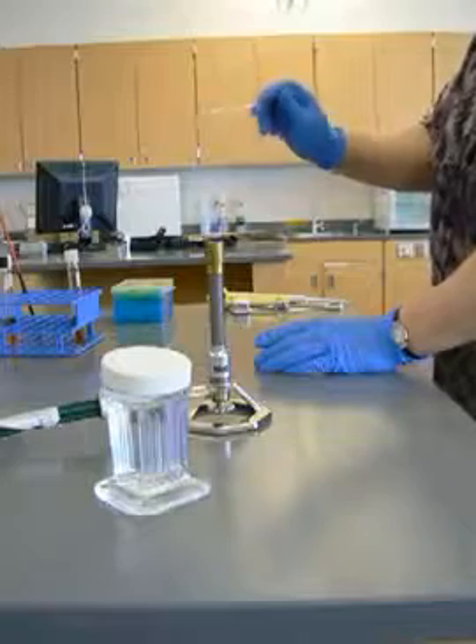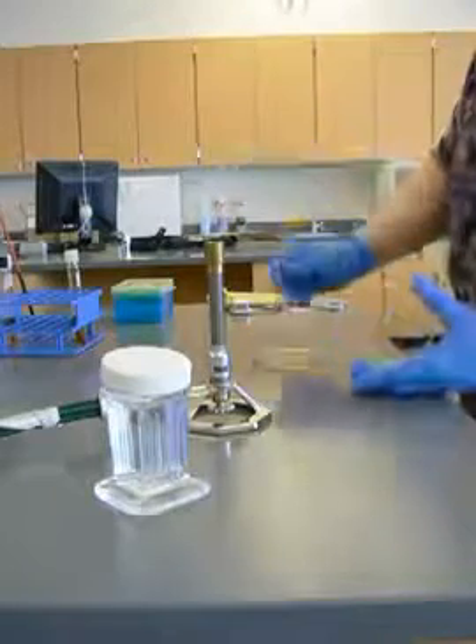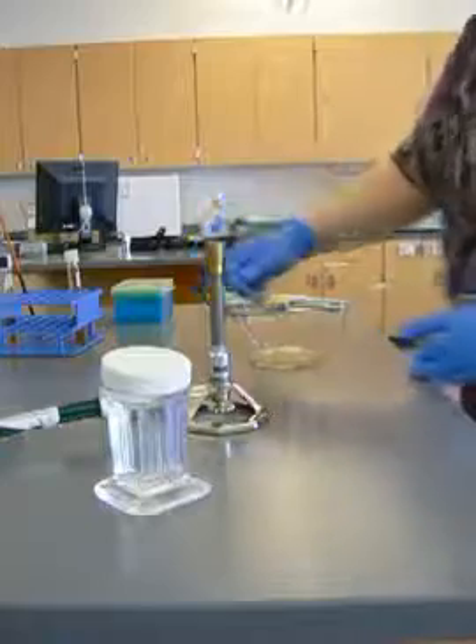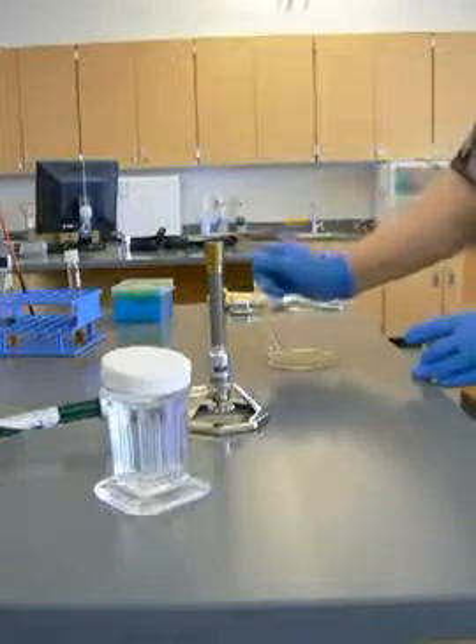Now I'm going to wait for this to cool a little bit. Then I'm going to take this and spread my inoculum out as evenly as possible.